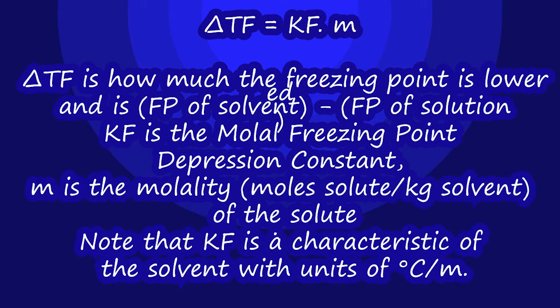From how much it lowers the freezing point, you can use that information to find out the molar mass of that compound. That's the second method to measure experimentally the molar mass of an unknown sample. One was, if the sample is volatile, you can change it to gas and use that to determine the molar mass.